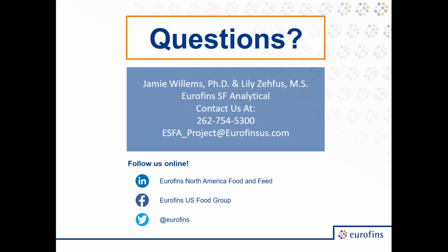Profiles of food and related products tend to be very complex. We can look at products without a control and look for anything that might be an obvious source of off-odor, such as a solvent or a fragrance that is associated more with, say, soaps and cleaning agents. However, if we're looking at, say, a subtle difference in profile that might be due to an ingredient issue, a control is ideal.